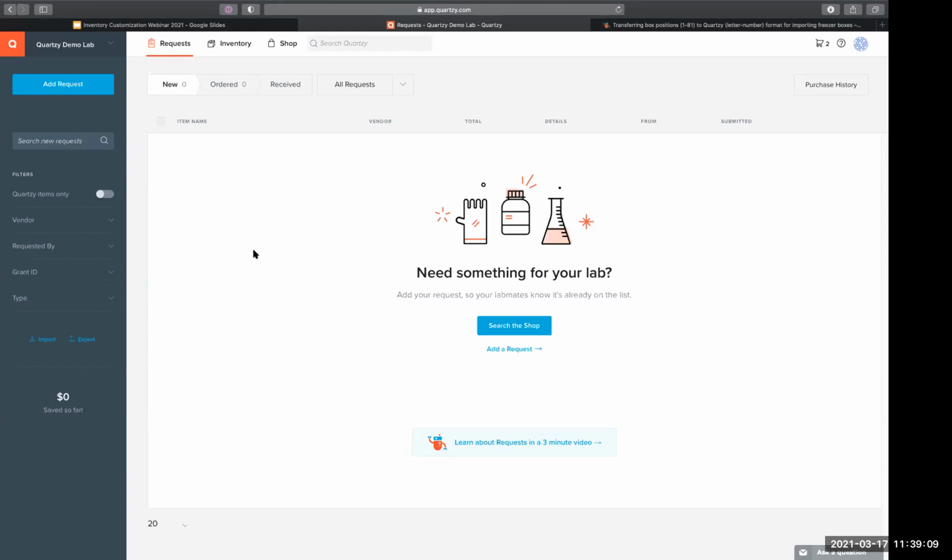Right, yeah, and that's definitely something our product development team is working on now. So we'll definitely release any updates in our newsletter. But I don't have a specific timeline on that quite yet, but it's definitely something that we're working on for this year. Yeah, thank you for that feedback. It is really helpful.